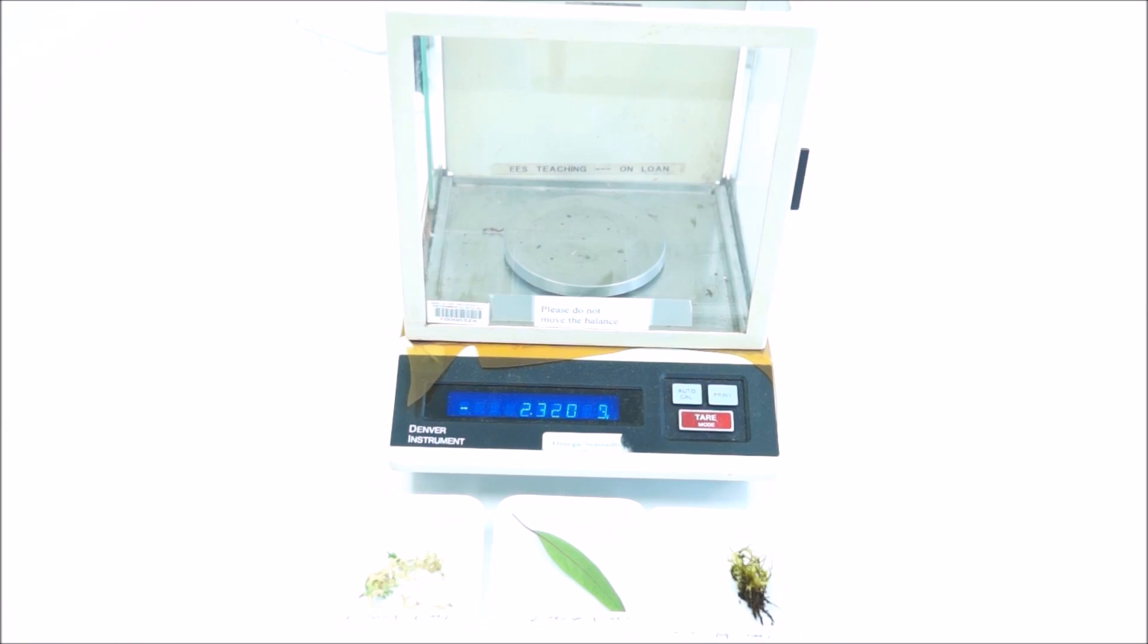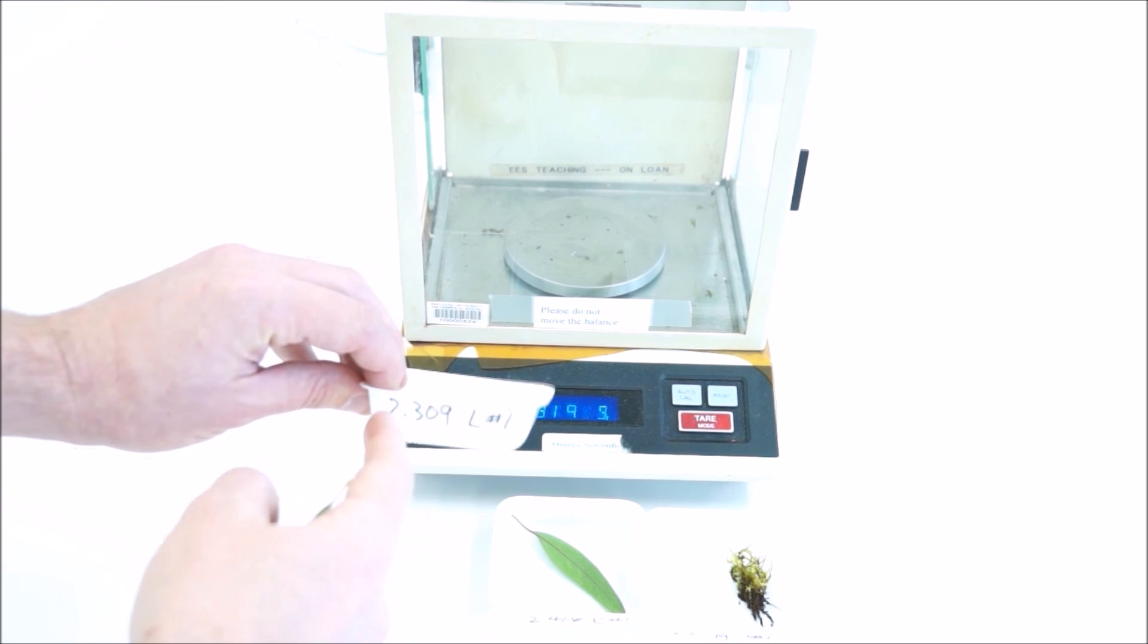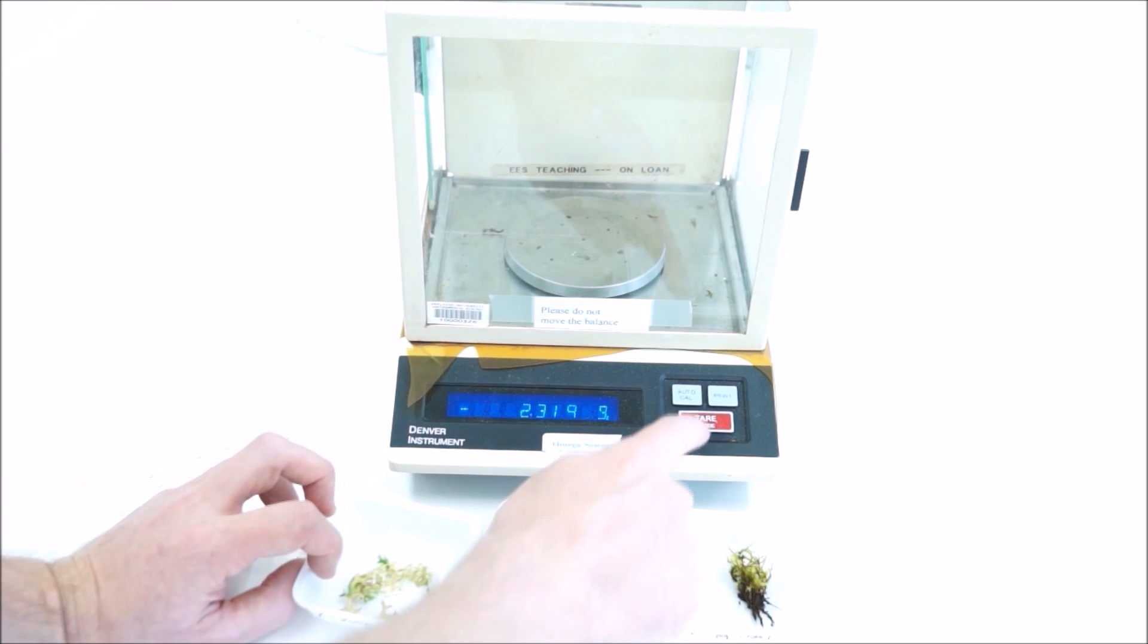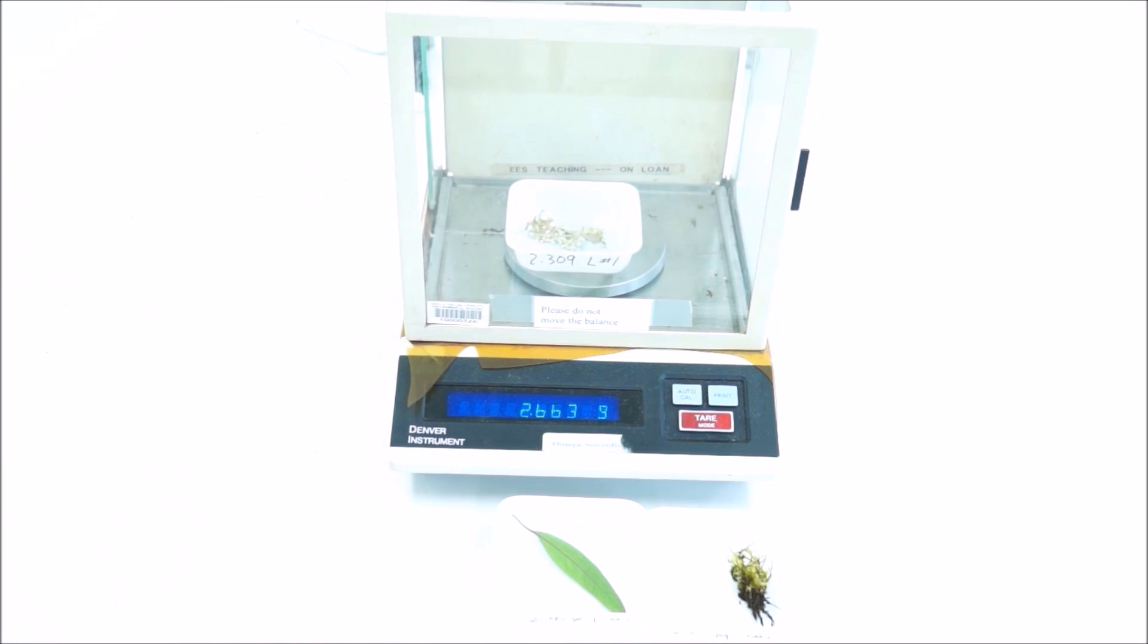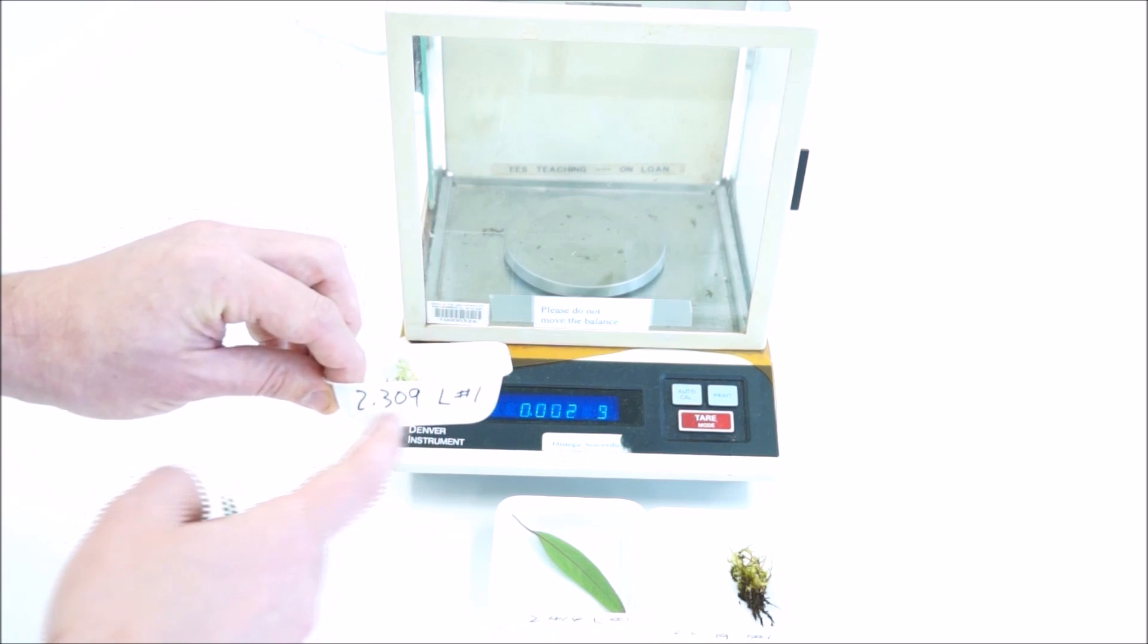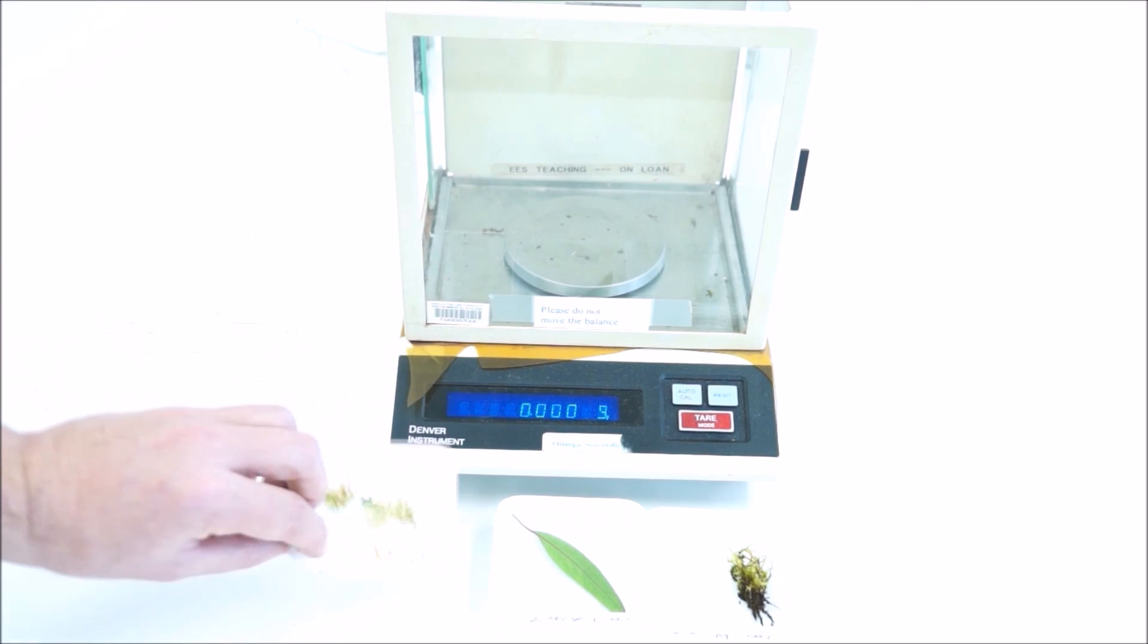You want to take your first measurement as soon as you set your samples up, and so this is lichen number one. The dish is 2.309 grams. Remember to zero your scales first up and then put them in. Wait for it to stop moving around. That's 2.751, and you can minus that number from your tray number—that's how much the lichen weighs.